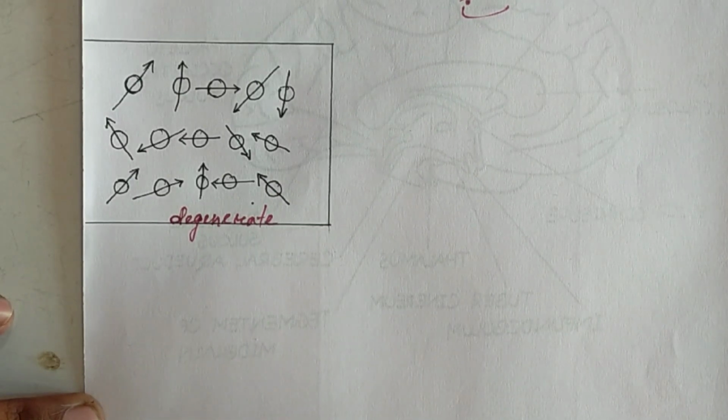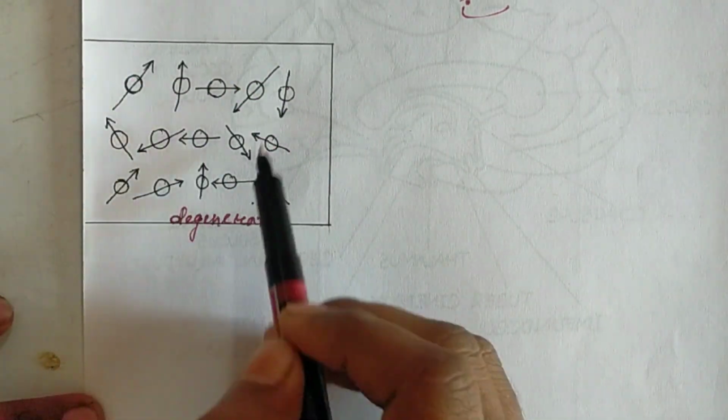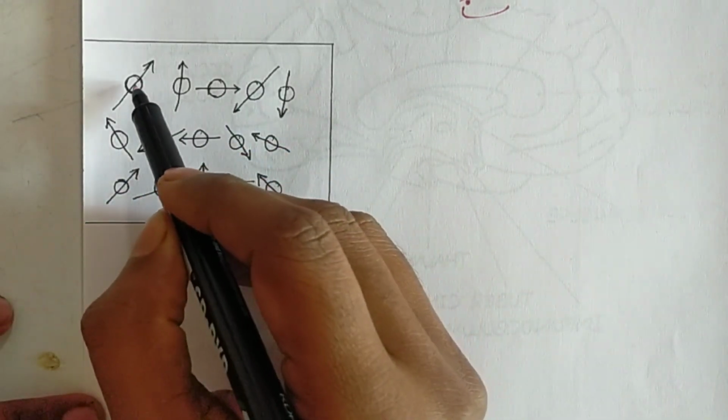There is no restriction for that nucleus, so it can orient in any direction. Orientation means, suppose these are some nuclei, so these nuclei are oriented in different directions randomly.